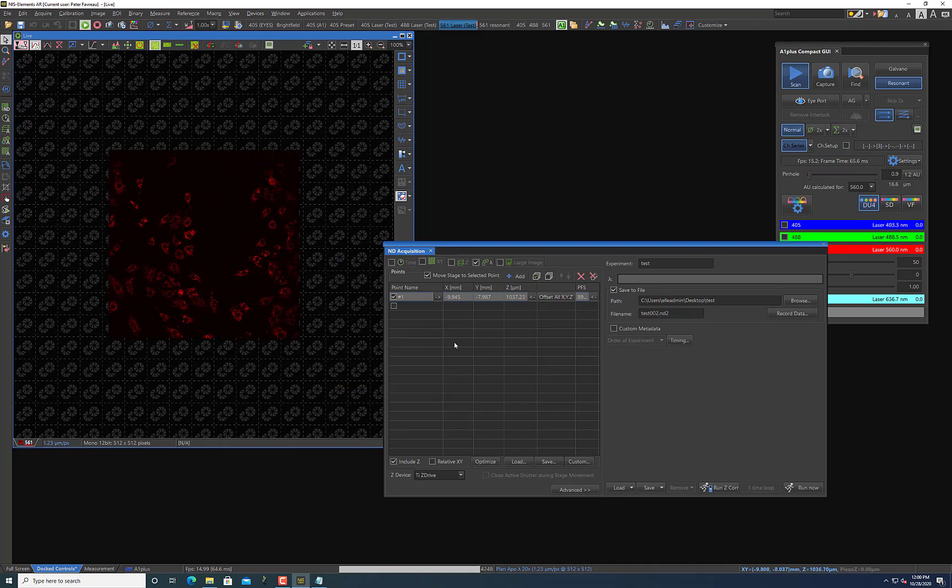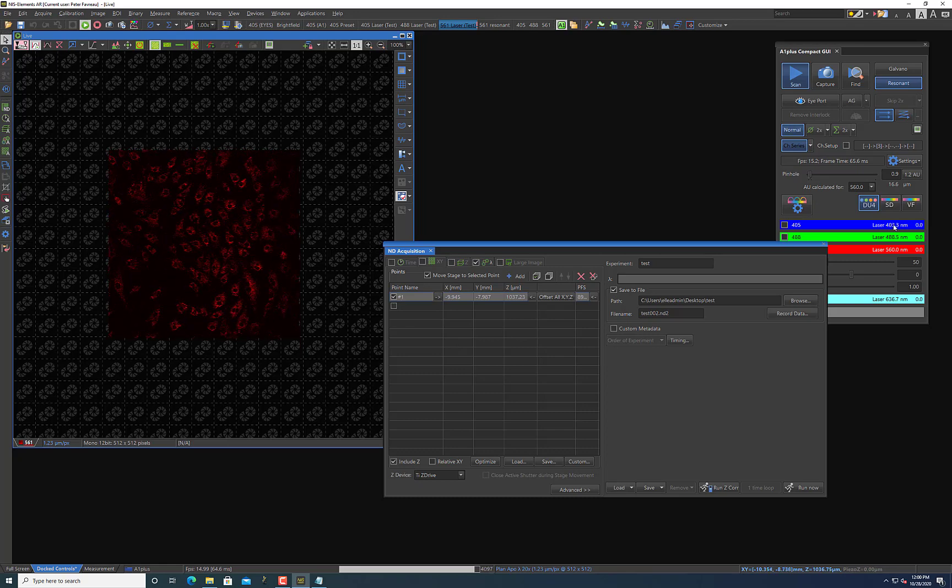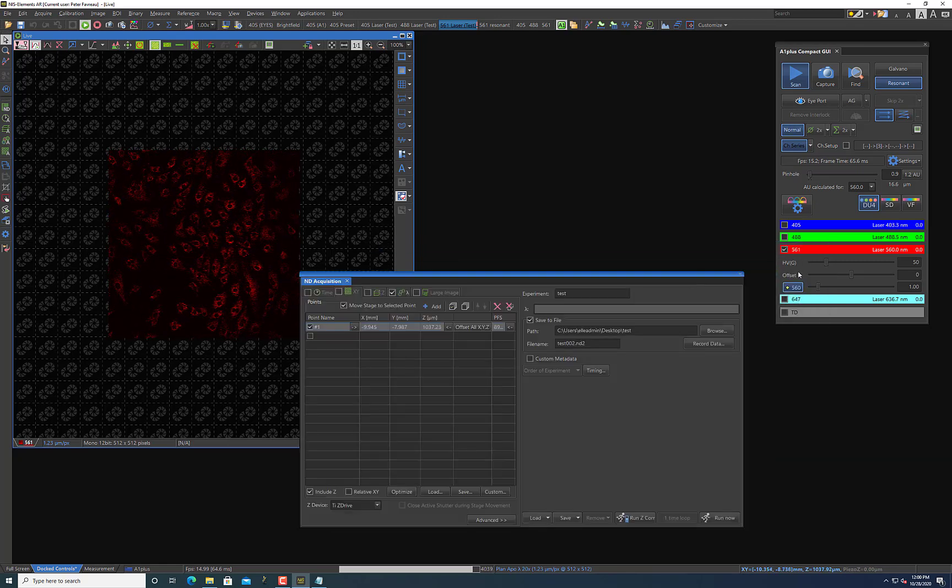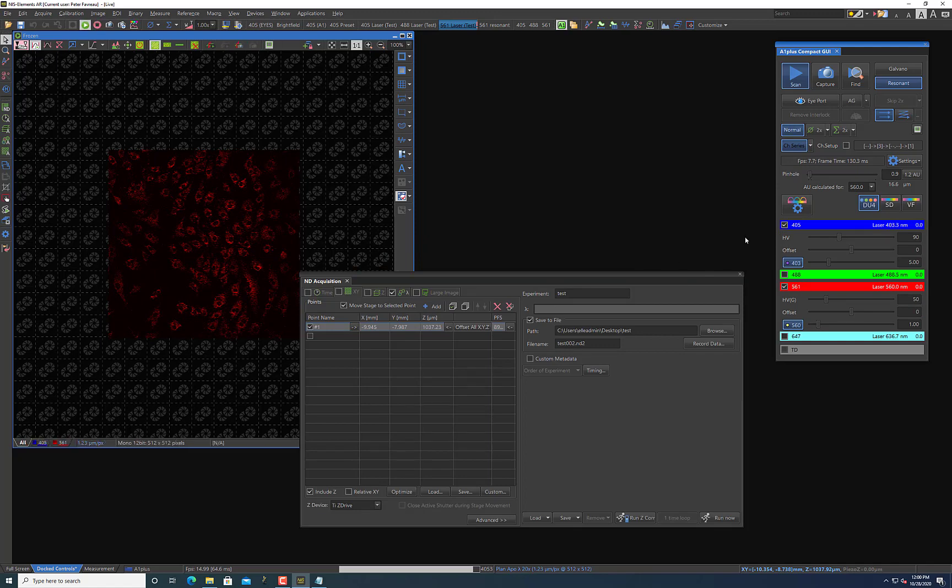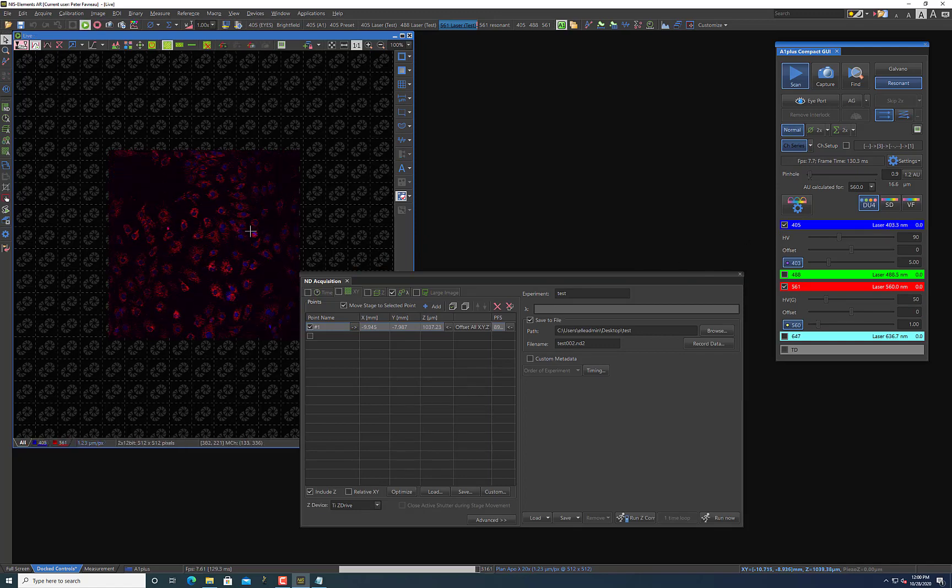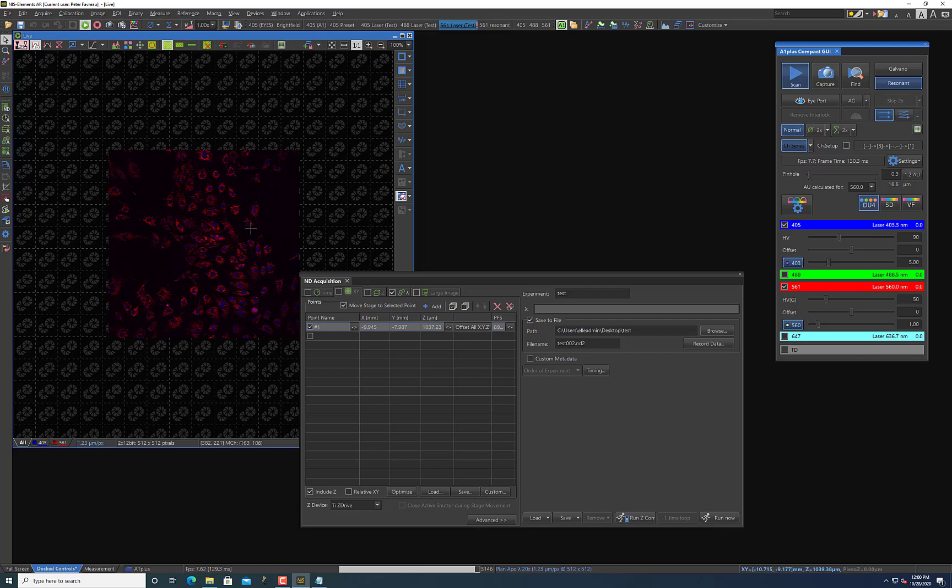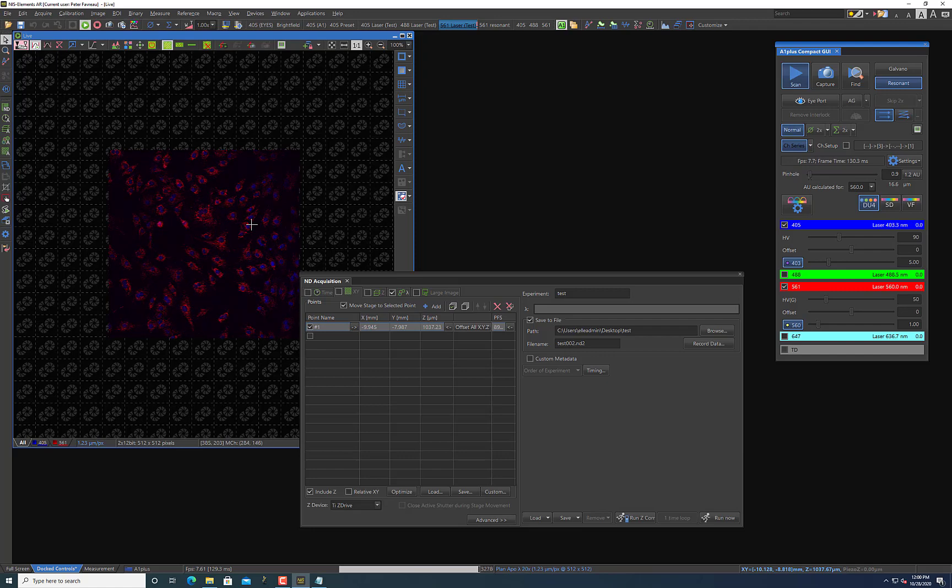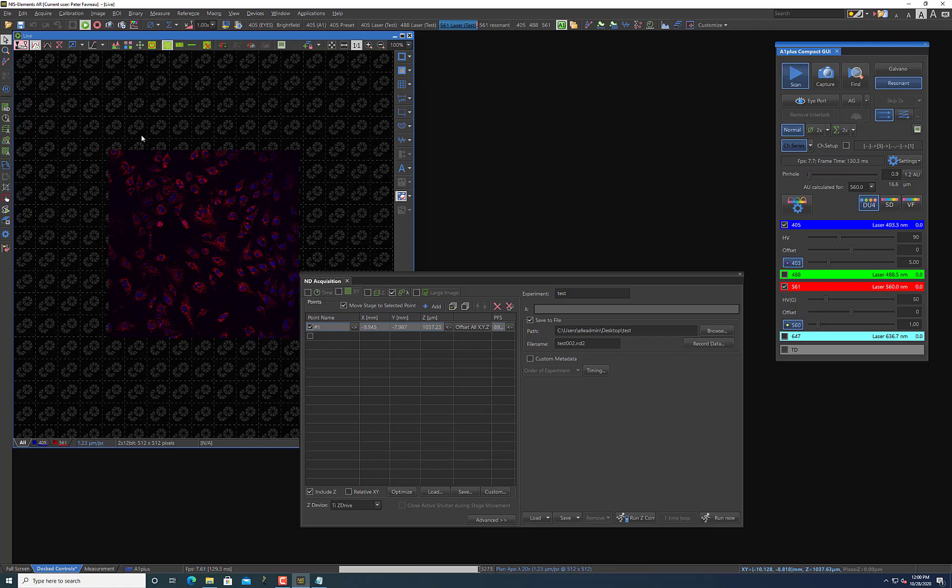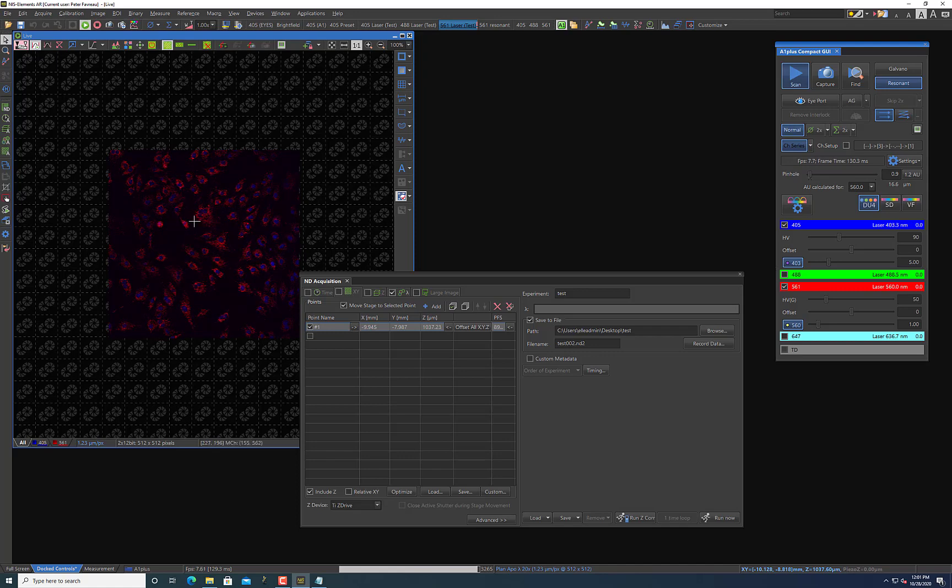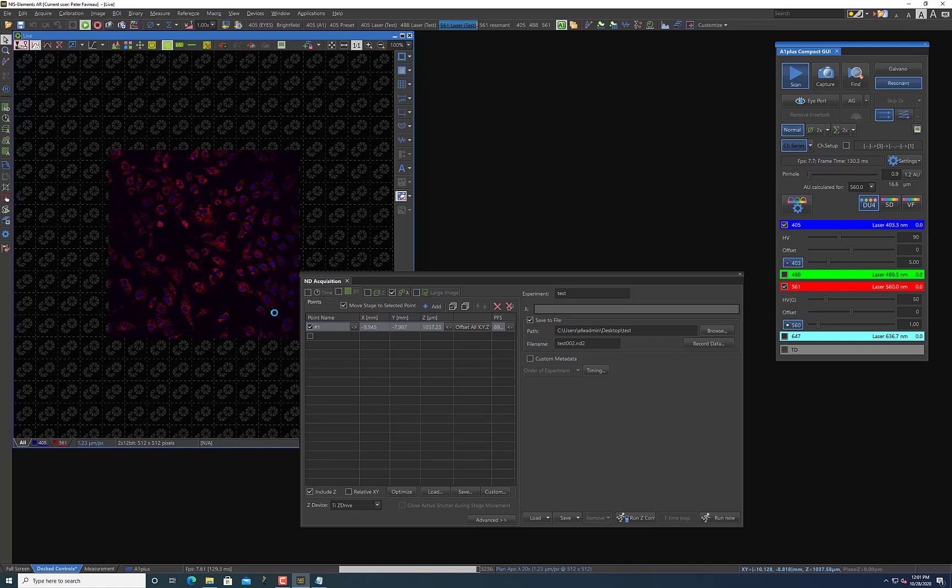So as I said, I'm just doing this. You may decide, by the way, that you want to know where all the nuclei are. Well, you can do multiple wavelengths here and it's still, I think, considerably faster than if you were to do the typical way of doing this through the galvano mode. It's up to you. Usually what people have is they have a specific fluorophore they're looking at, and it can just take a long time to find the specific areas in your sample that contain that fluorescence. So you can search many different wavelengths here and ultimately quickly find out where those fluorophores are hiding.